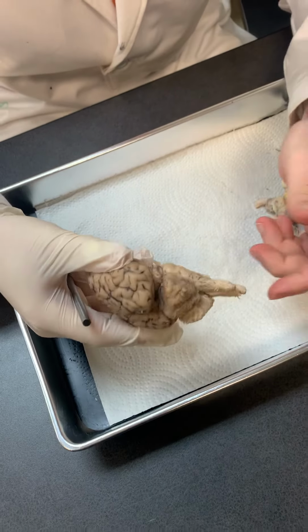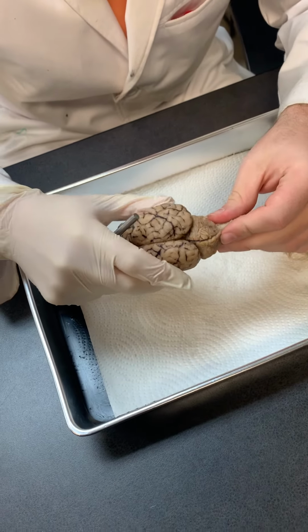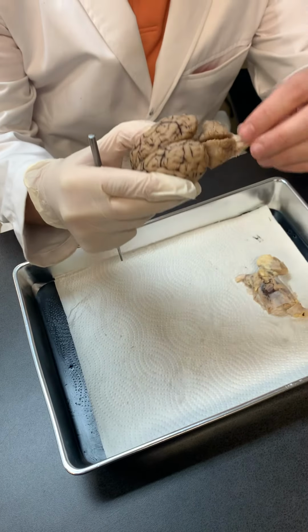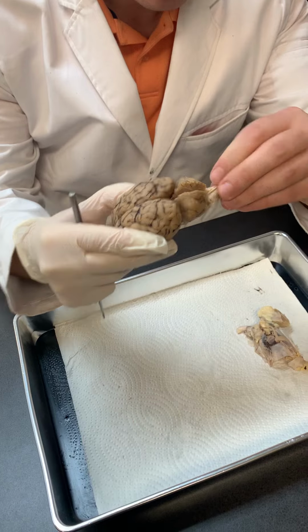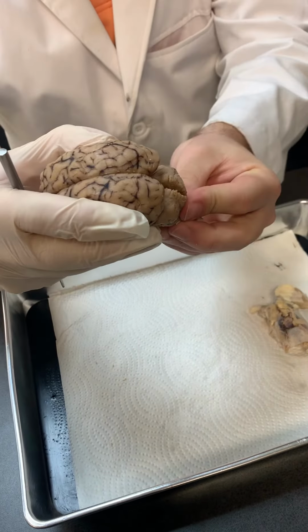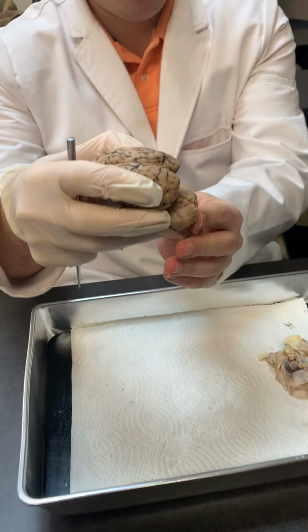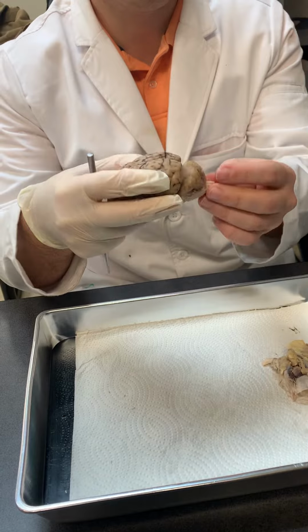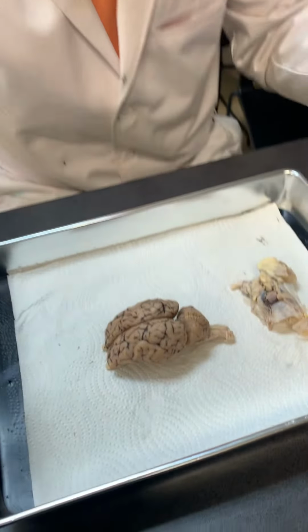Some notable things when we start is that the sheep goes back and its head sticks out forward, so we can see that we have the spinal cord that I have my hand on now, right? This is going to come posterior in sheep. And in humans, the brain is going to be a little bit more formed like this, where the spinal cord goes inferior, right? So a little bit of a structural difference, but nothing major here.